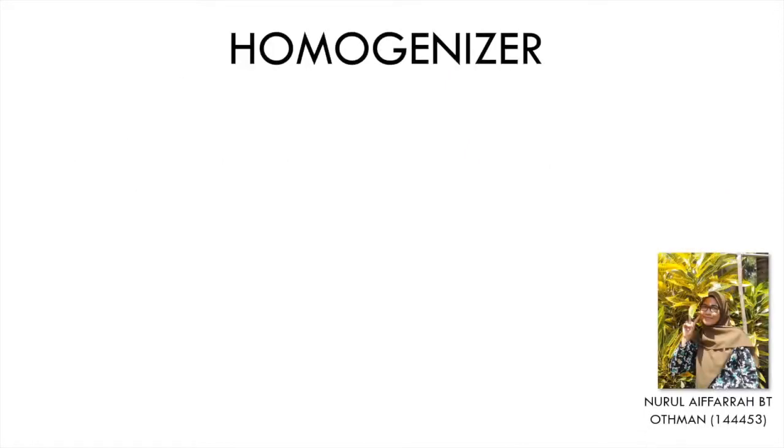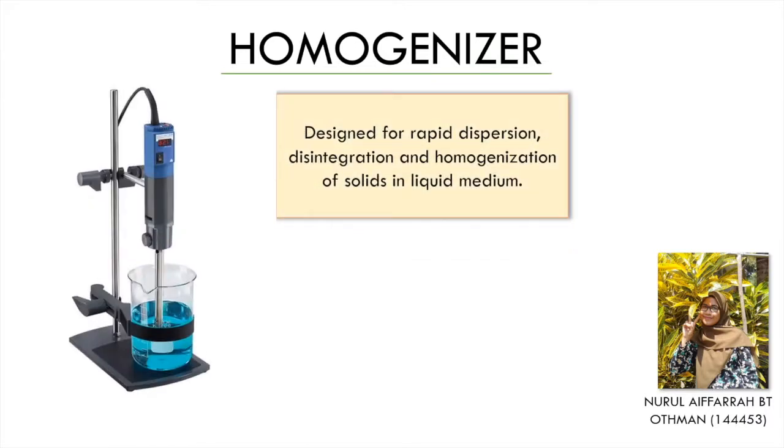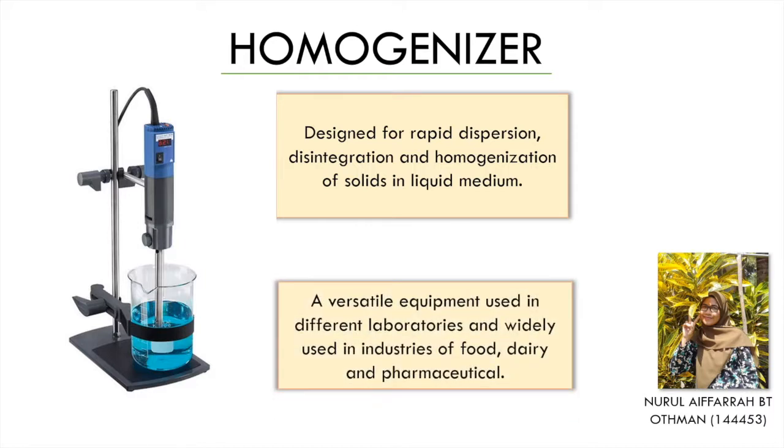My name is Nurul Aifara binti Osman and I will explain about the homogenizer. A homogenizer is designed for rapid dispersion, disintegration and homogenization of solids in liquid medium. It is a versatile equipment used in different laboratories and widely used in industries of food, dairy and pharmaceutical.